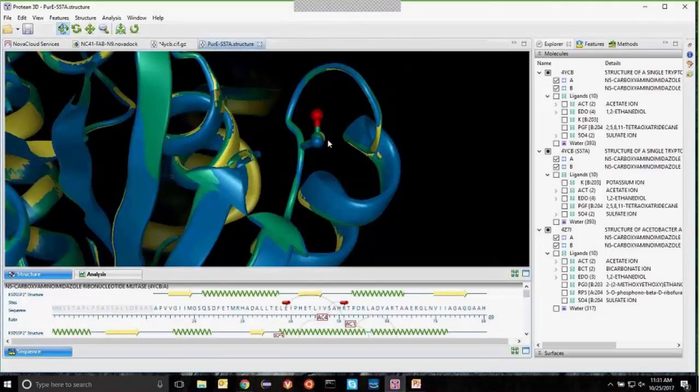But this is a great tool if you're interested in doing what-if scenarios, if you are curious about sampling regions and seeing how side chain identities would affect the stability of the region or the protein. You can actually use this to quickly model mutated protein structures that were altered artificially to make them crystallize better, and make them look more like the wild type if you're trying to use that construct to help guide some of your experiments.